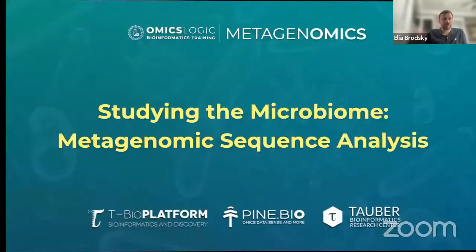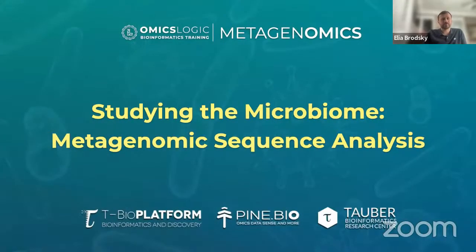So the purpose of today's session is to discuss the microbiome, how we can use metagenomic sequence analysis to study the microbiome and understand how microorganisms interact in their natural environment, looking at the community composition and structure, thinking about species richness, and understanding the functional roles that some of these microbial communities can play in many areas related to human health and disease, as well as biotechnology and agriculture.